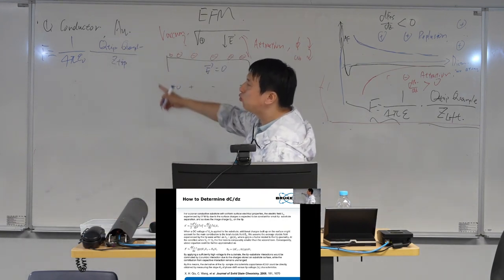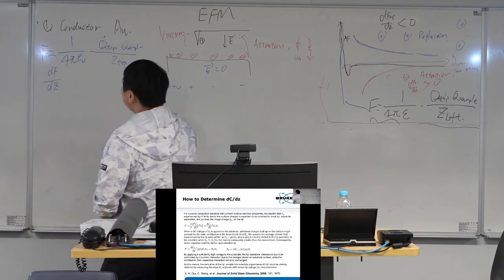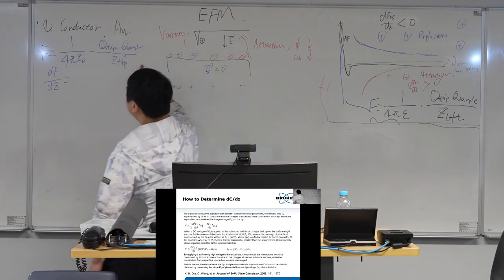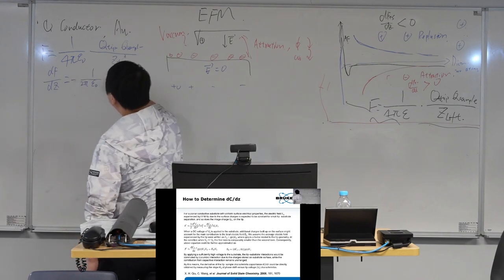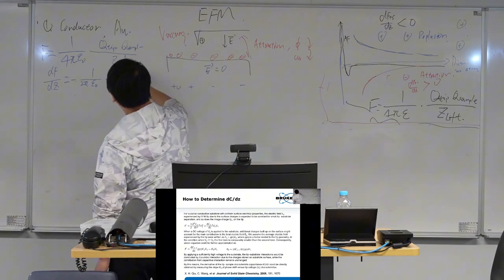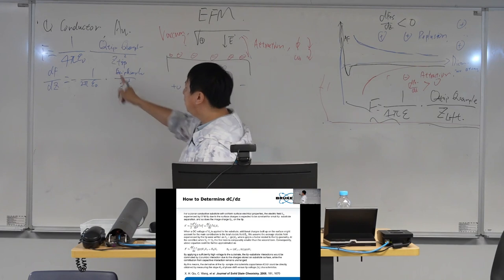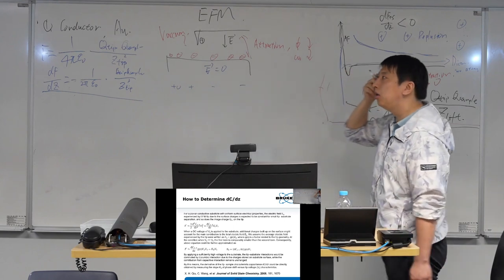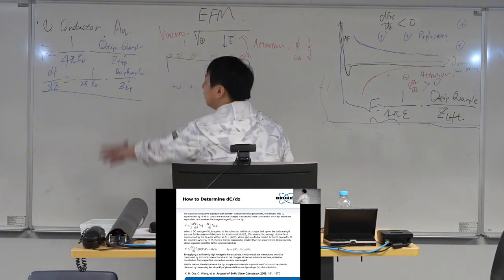So what's the force gradient here? The dF over dZ equals, I'm sorry, there's a square. Thank you. There's a square. So it will be negative 2 over 4 pi epsilon 0 Z tip cubed Q tip Q sample. So if we know Q tip, if we know Z tip, this one we can calculate using the Coulomb equation, right? Quite simple.